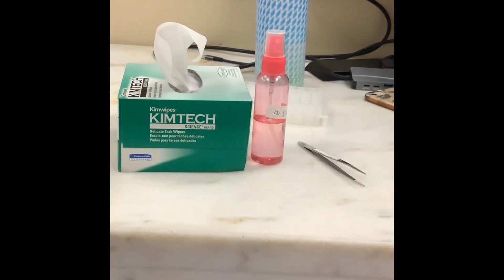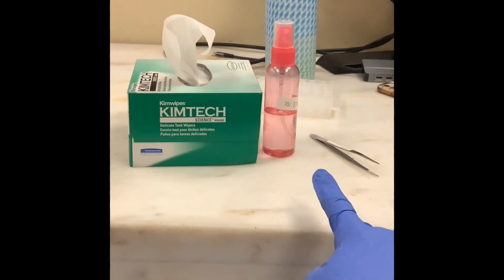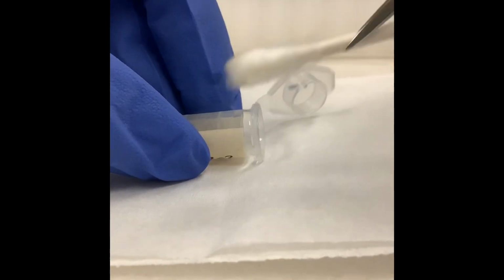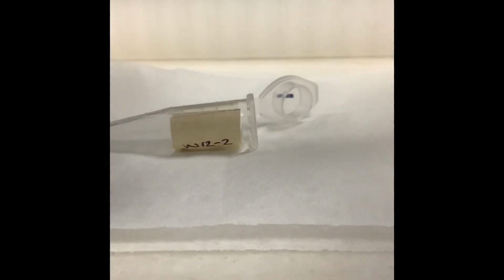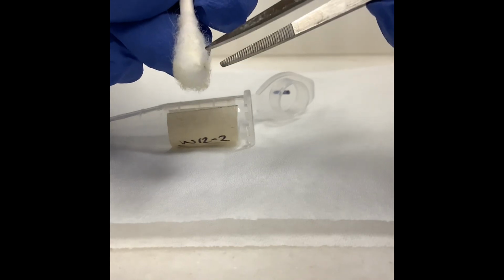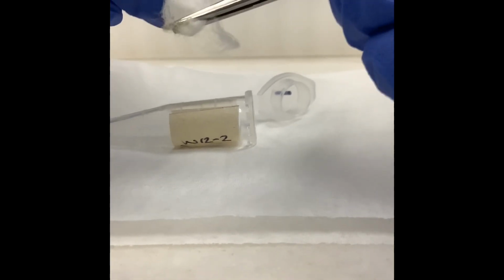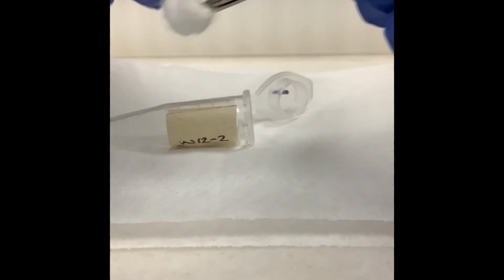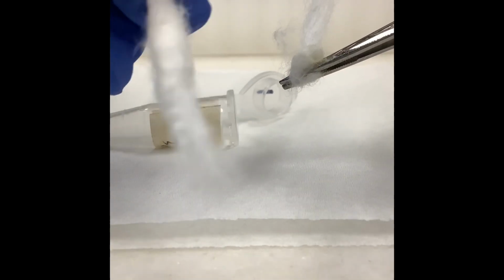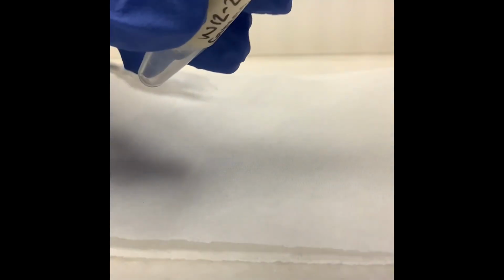For the next step, we're going to be removing the cotton from the cotton swab, and for this we're going to need Kim wipes, 70% ethanol, and forceps. So in this step, I am taking out the Q-tip, and then I'm going to examine it and see where the pollen is. So it's a little more yellow colored here, so I'm assuming most of the pollen is on this side of the swab, and then I'm just going to try to get most of the cotton from that side, just rip it off. And then you can look at the swab after, make sure you're not leaving any pollen behind, and then you're going to put the cotton back into the same tube.